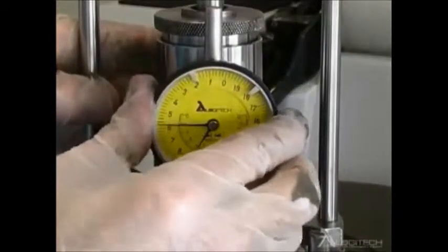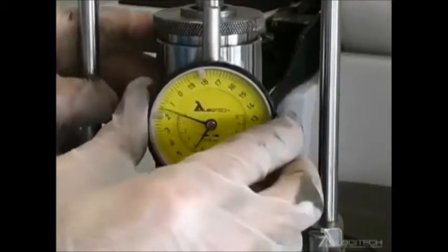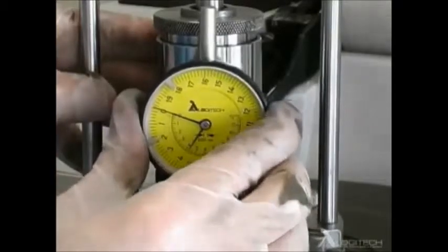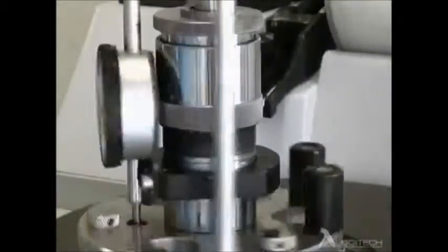The PP5 jig comes as standard with a dial gauge, as shown here, which indicates stock removal. The scale is divided into 2 micron divisions and measures material removed during processing.